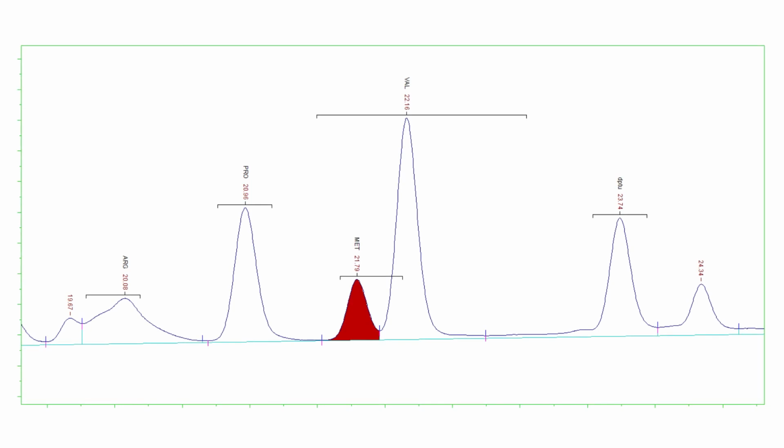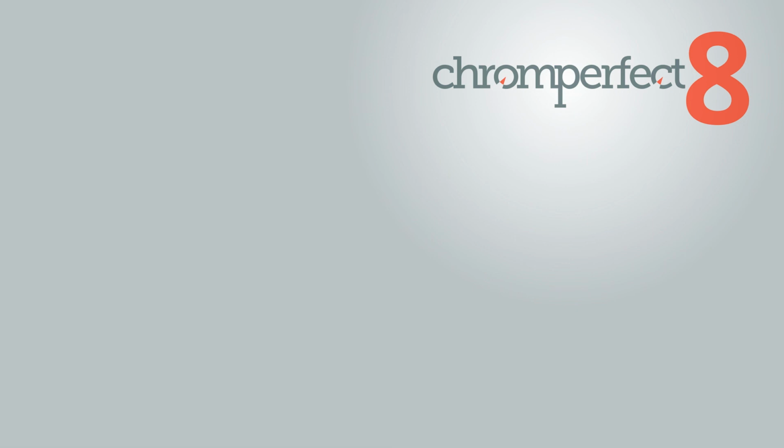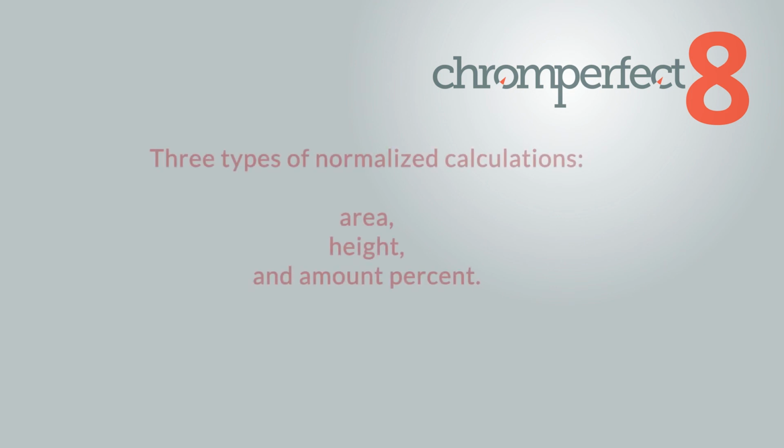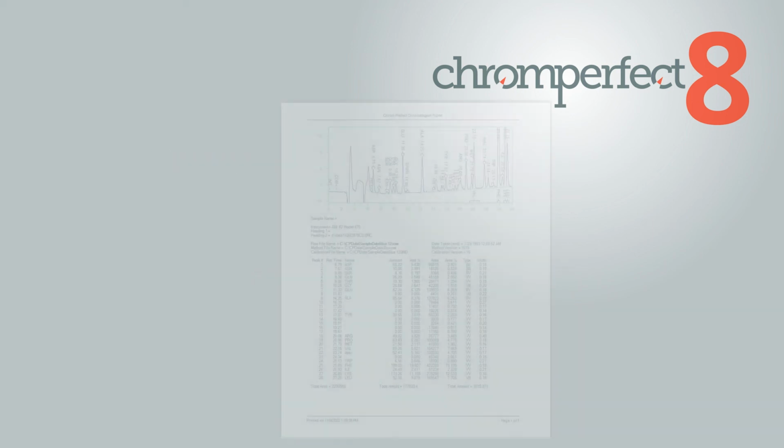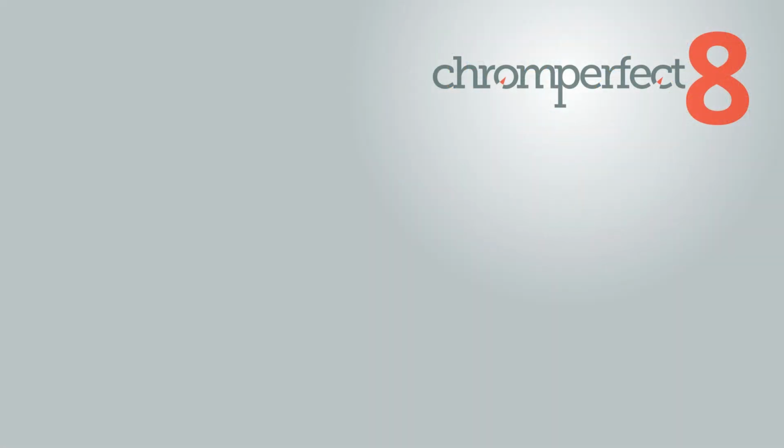If two windows overlap, and a peak lies under both windows, then that peak will contribute to both components' window response and window amount. Therefore, the total of the window responses may be more than the total response of all peaks. Normalized quantification. Some applications require that the results be reported in terms of a percent of the whole. This is called normalized quantification. Chromperfect supports three types of normalized calculations: area, height, and amount percent. All three normalized values appear in the footer of the standard report. Quantification with area percent or height percent requires no calibration file.